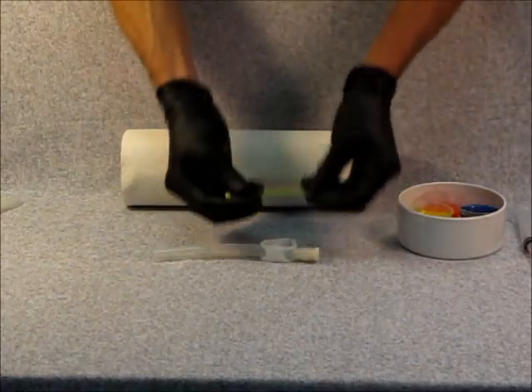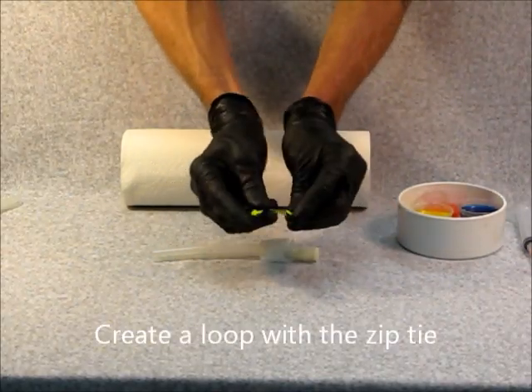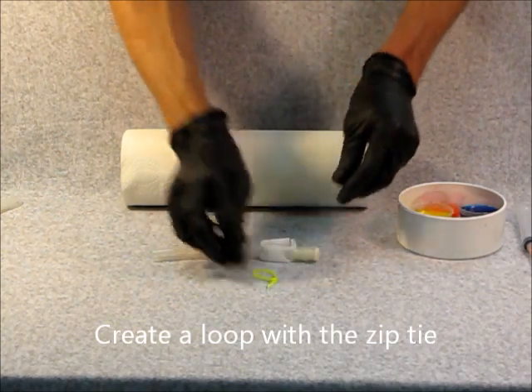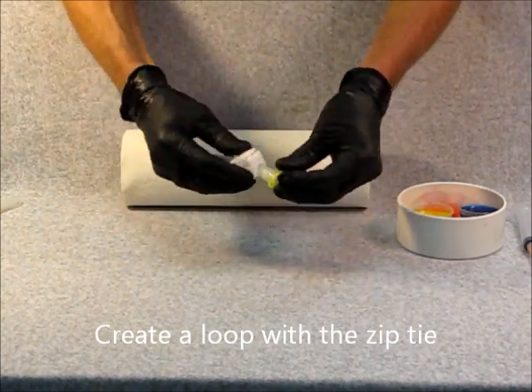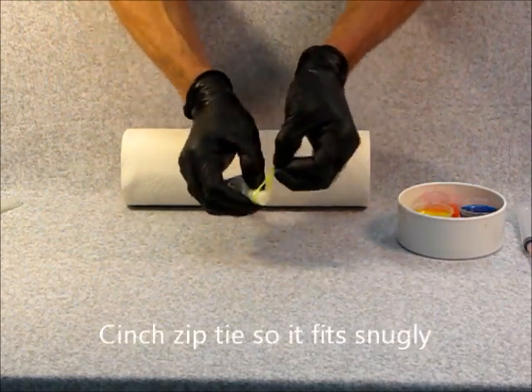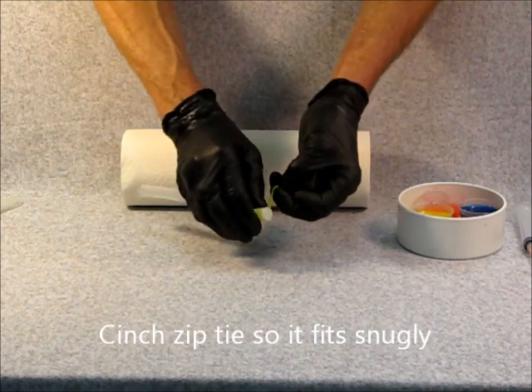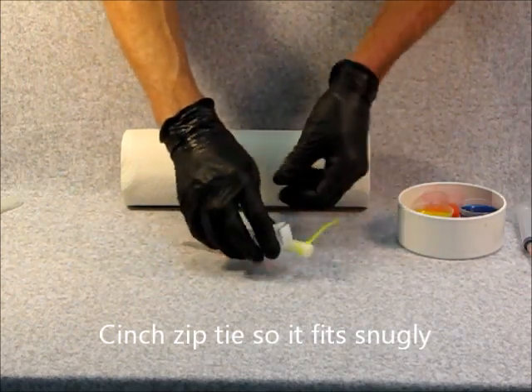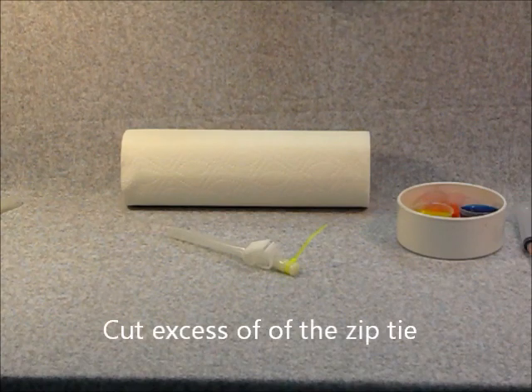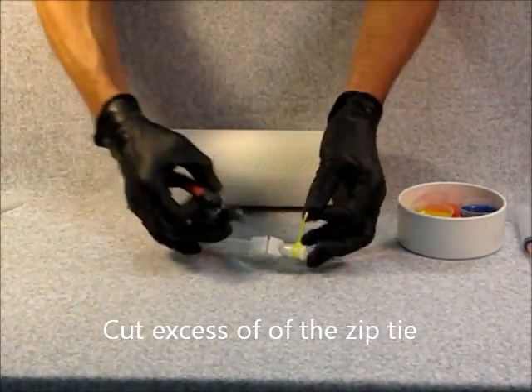The next step is to create a loop with the zip tie. Wrap it around the end cap and cinch the zip tie so it fits snugly. Then cut off the excess of the zip tie using the crimpers.